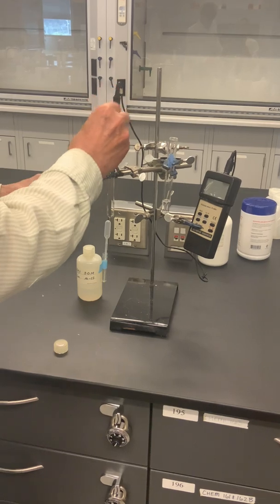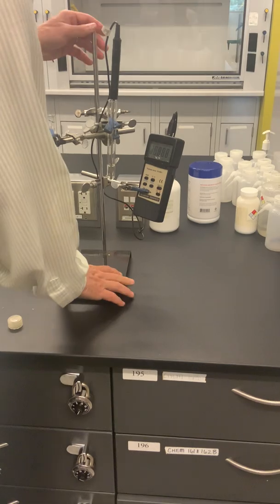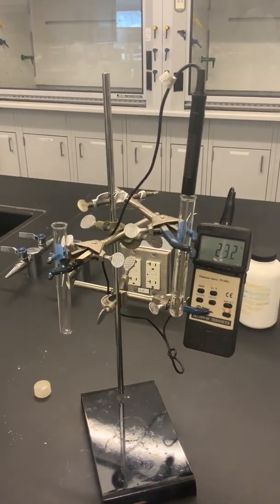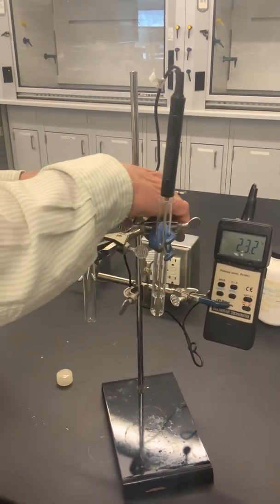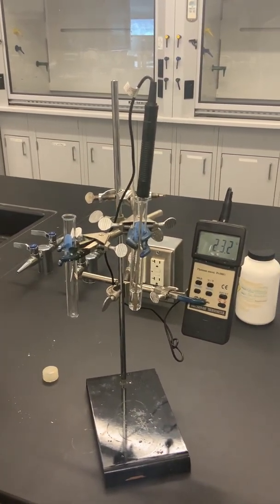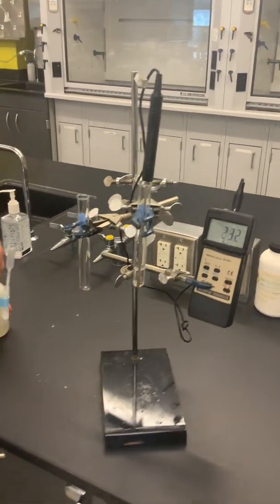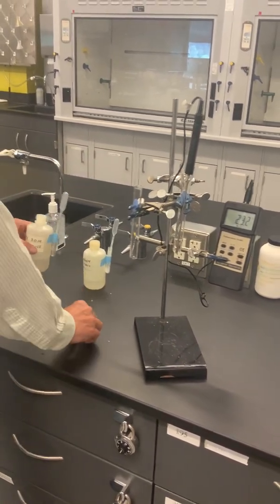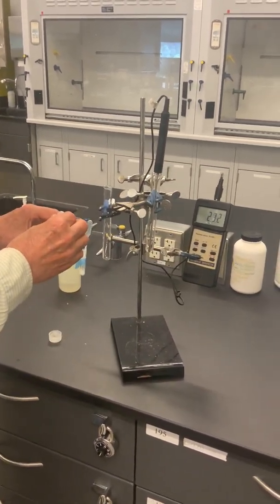And once again, monitor the system temperature. Give it a second for the temperature to stabilize. Can everything be seen there? Yep, we're good. Again, room temperature, 23 degrees Celsius. All of these reagents have been sitting out on the bench top for a while. And now here I'm going to add the solution of hydrochloric acid to the solution of sodium hydroxide.